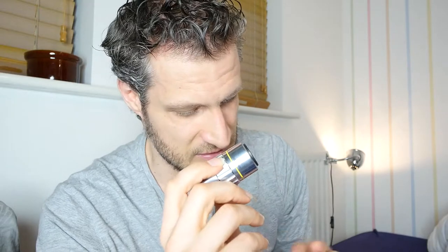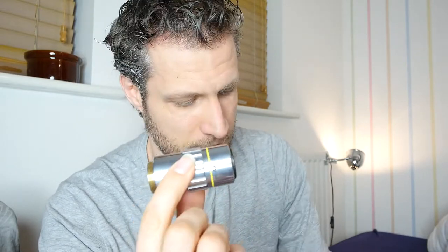I also have this lovely brother, which is a Mitutoyo 10 magnification, numerical aperture 0.28. This one has a working distance of 33 millimeters. That's so amazing. I know you are not interested in microscopic photography with a digital camera, but I was, and that working distance is amazing. It's huge. Even the lens is huge.